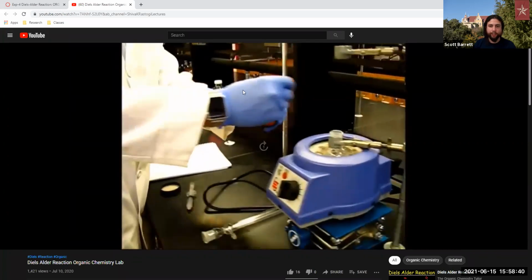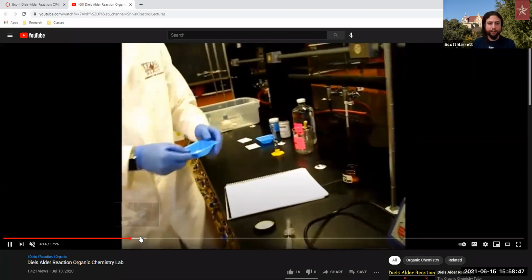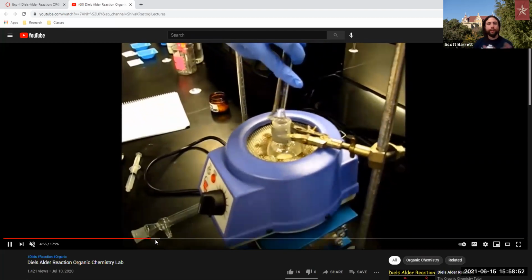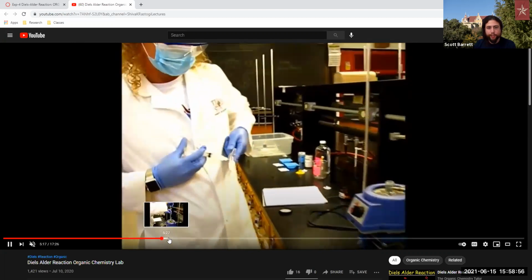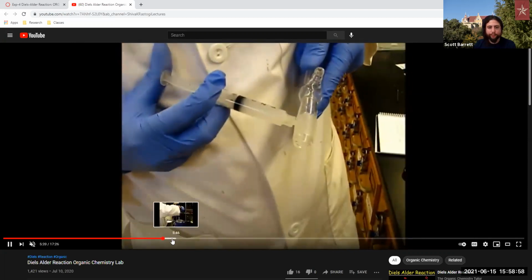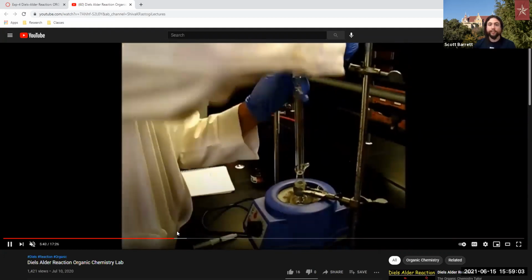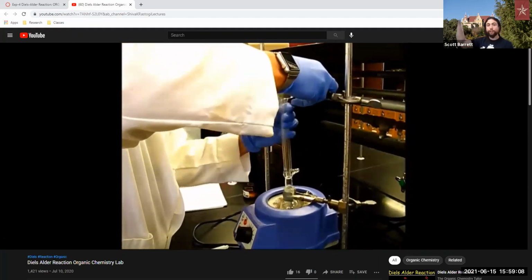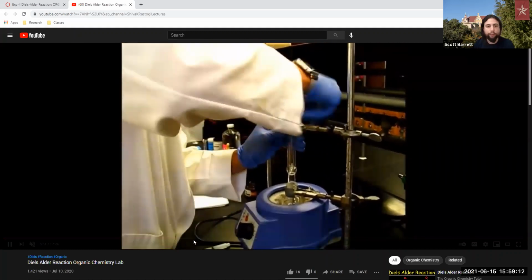And then, of course, you need to be dressed appropriately in lab attire because it can be dangerous with extreme heat. He placed the boiling stones in there, and then, of course, we just add our stuff in. Like I said, it's very, very straightforward. You put everything into your reaction flask, and then you get going. So here we have our condenser, and the condenser is utilized so that we can reflux. When the xylene starts to boil up, the water goes through the condenser and cools that xylene back down, condensing it, allowing it to go back down into our round bottom flask.